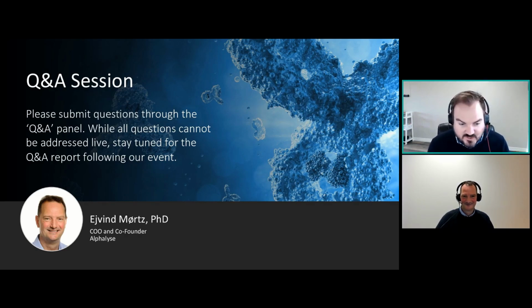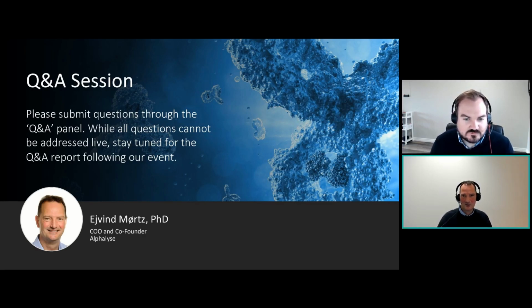I think you already answered this question, but the next question, which this leads into, is it also possible to quantify enzymes added during process development? And then I guess the answer is yes. Yes, it is. Often you have it recombinantly in high amounts, so we can do very accurate quantification of this one. And this is actually one of the typical problems that you may have: if you add enzymes to your product, you also have to document the clearance of this specific protein to the authorities. So you have to have a specific assay for this protein that you are adding.